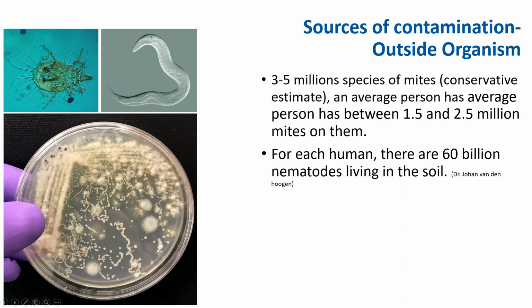Nematodes are another culprit. For each human, there are 60 billion living nematodes in the soil. So the nematode population outnumbers us. A nematode, or roundworm, can hitchhike from your body or from anywhere onto plates, onto cultures, onto medium as well.